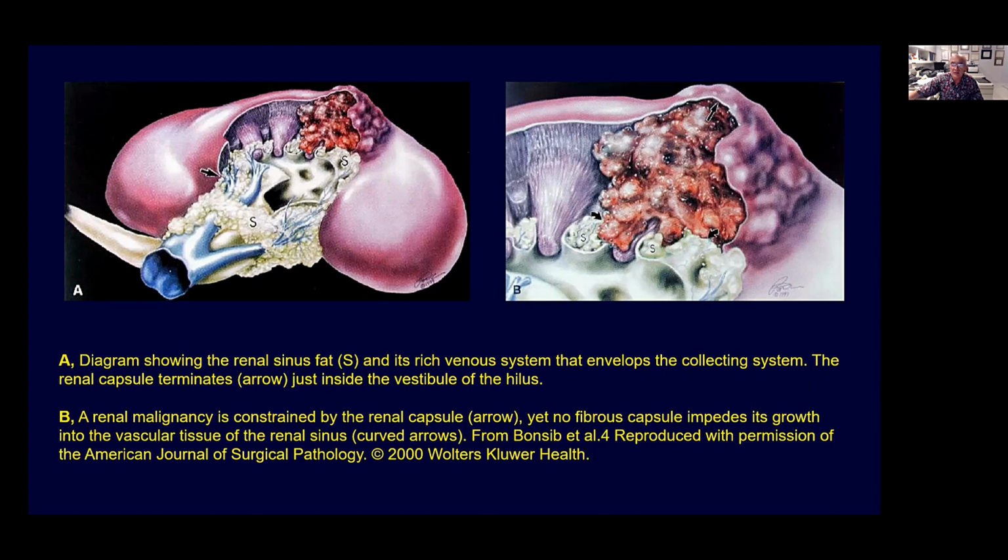But anyway, sometimes, for example, the tumor is too close to the capsule, and if the capsule is not completely smooth, indicating that there is no invasion through the capsule, and if you find some kind of irregularities, then it's important to mention that.